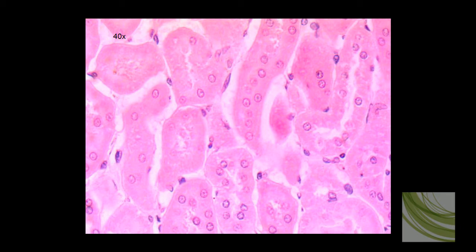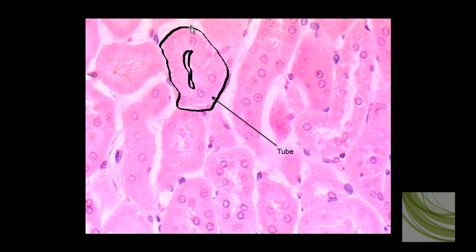Here is that same slide using the 40X objective, and now we can see some of these little tubes a lot clearer. However, the cuboidal cells are not that differentiated — it's kind of hard to see them on this slide, but there would be a tube, there would be a tube. We can see the nuclei of the cuboidal cells. Here I've outlined one of the tubes that is lined with simple cuboidal.